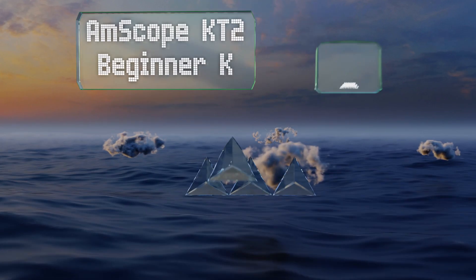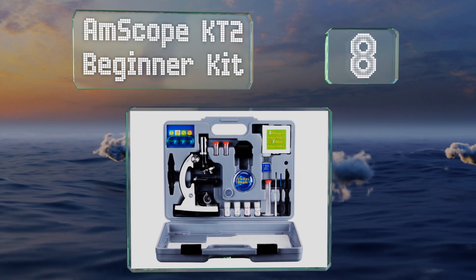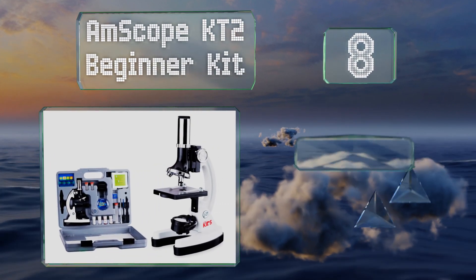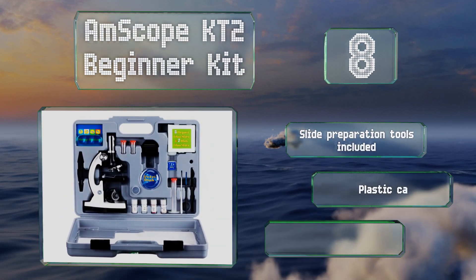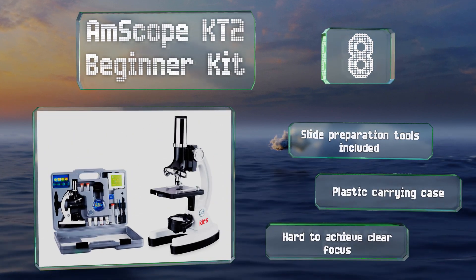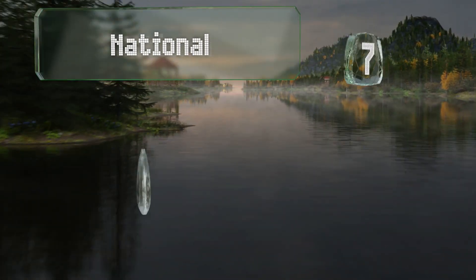Starting off our list at number eight, the AmScope KT2 Beginner Kit is not professional grade, but it does include a scope with an impressive 1200 times magnification power. Albeit not the most durable model, it comes with slide preparation tools and a plastic carrying case. However, it is hard to achieve a clear focus.